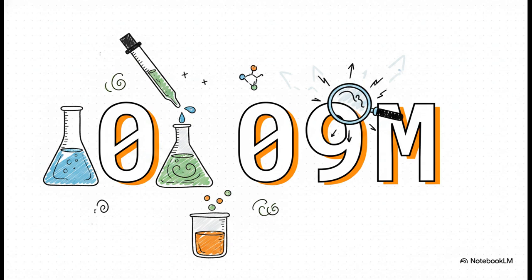By meticulously using a known standard and watching for that equivalence point, we literally made the invisible visible, and we put a precise number on an unknown suspect.